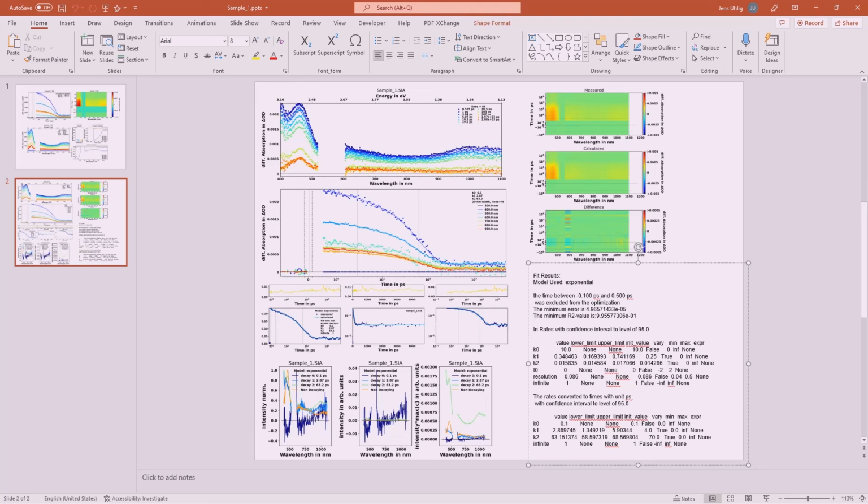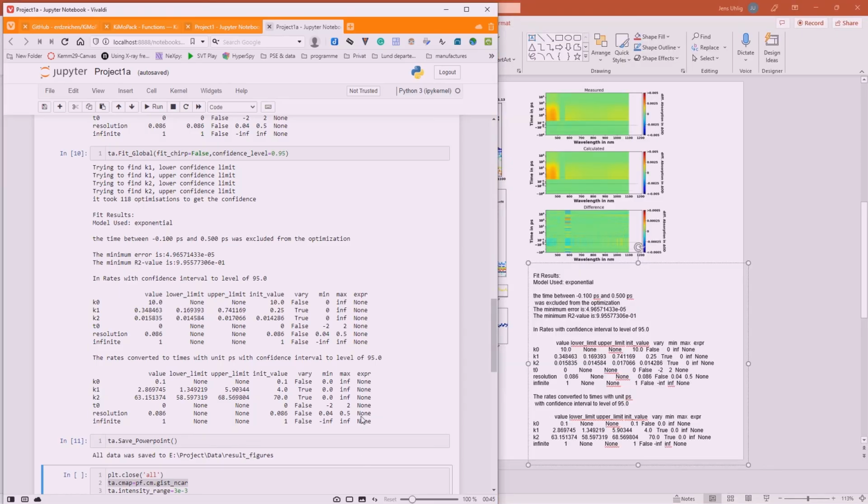Those types of reports I typically store for each analysis, together with the plot files and the Jupyter notebook, and I can always regenerate the files. If one wishes, one can finish the analysis by saving the whole project.